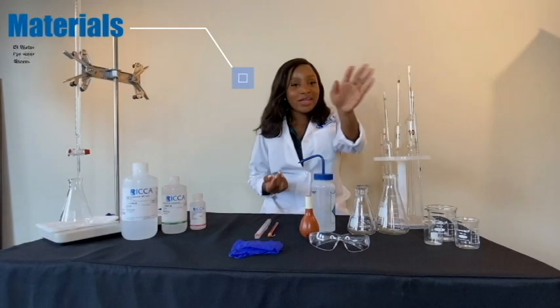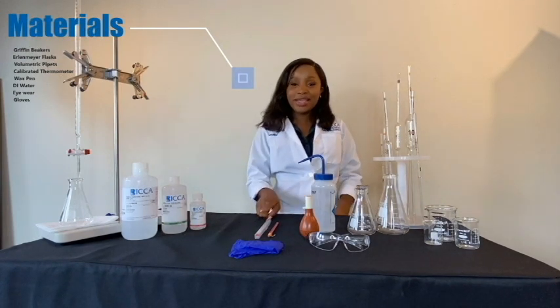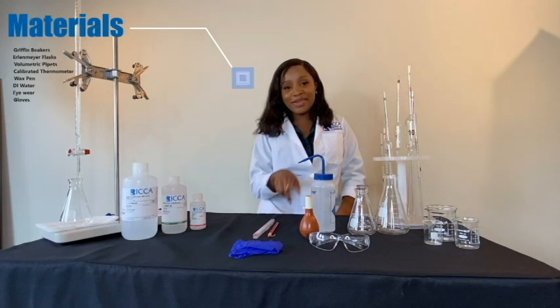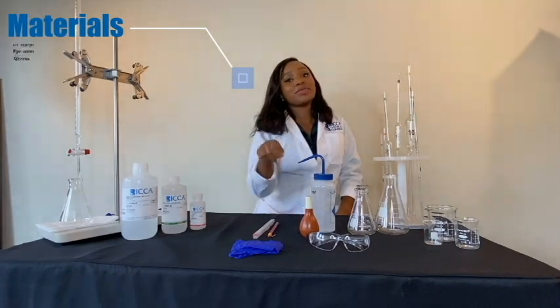Here are the materials required: Griffin beakers, Erlenmeyer flasks, volumetric pipettes, calibrated thermometer, wax pen, DI water, bulb, and of course eyewear and gloves for protection.